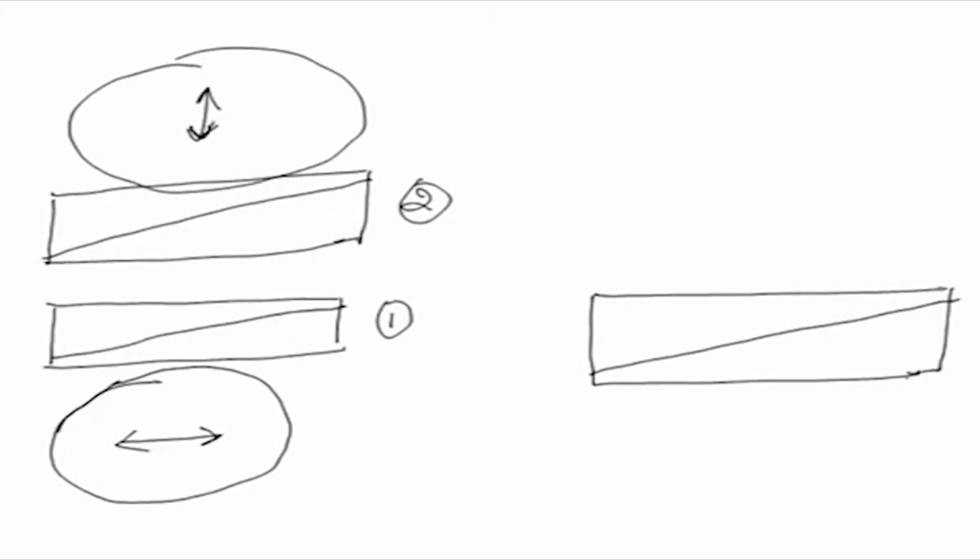Most general light is unpolarized, that is, it vibrates in different directions while propagating in one direction. When all these vibrations are there, it is called unpolarized or non polarized. But when you allow the light through a polarizer so that it vibrates at only one angle, it is called plane polarized light.